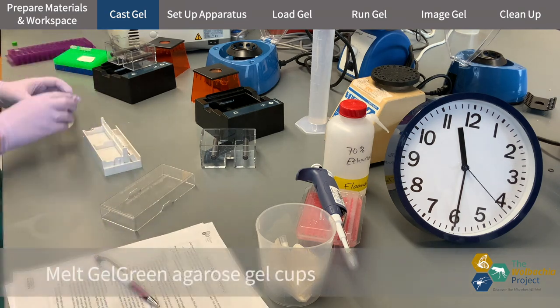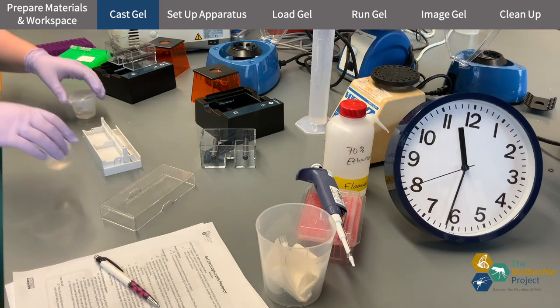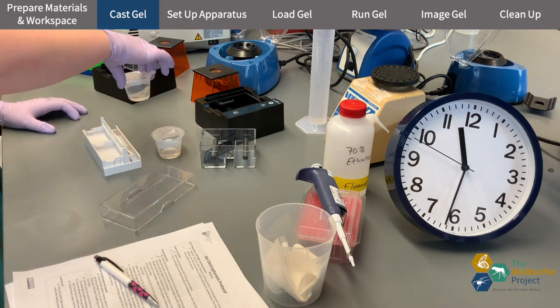I peel off a little of the plastic off of the tops of the gel green gel cups from Mini One and microwave them for about 20 seconds or until it's all melted and there are no lumps.